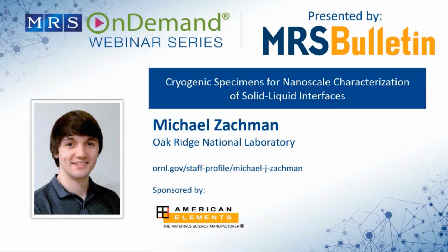Yes, actually, in a lot of materials in the FIB, as you get very, very thin, you can start to get some bending. So if you want to see what the crystalline structure of the material is, I actually don't know the implications of that because we weren't interested so much in that. But I would say if you are working with a FIB, that's something you need to be careful about, because you can see bending of your sample a little bit once you get down to these very thin lamellas. So for any crystalline material, if that's what you're interested in, you should be careful about that.